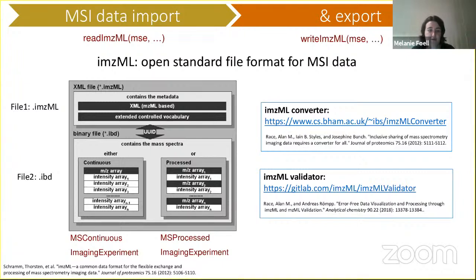During the course of an analysis, often the types also change, and we will see this later. And don't get confused: even though this is called a processed imzML file, this has nothing to do with pre-processing or any type of processing. It's just what the file type is called when it stores the m/z array for each spectrum.